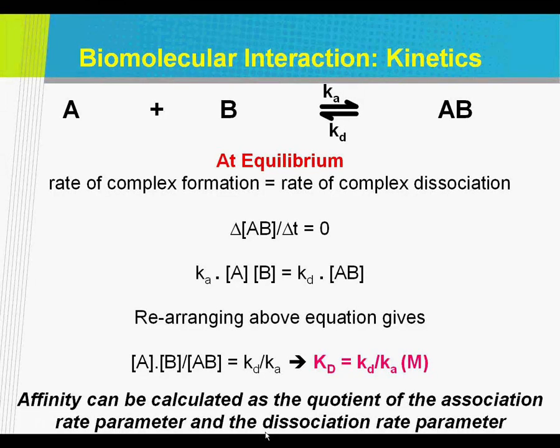Now I'd like to talk about the assay that we have developed to screen the antibody fragments, and a key issue here, the key word here, is the antibody fragments.